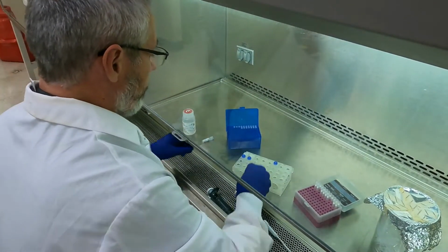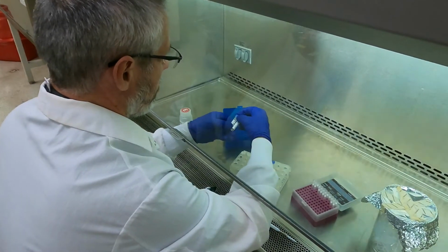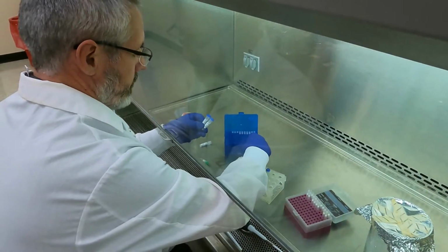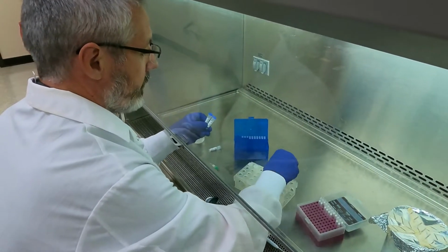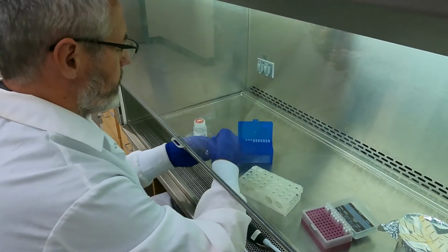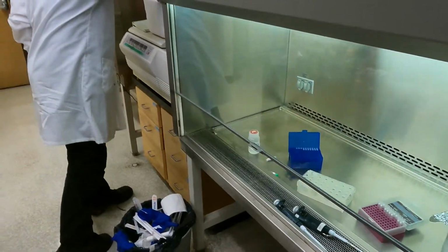And leave that for at least 20 minutes. So C16, C16, CU, good. And here is the buffer. It's IDTE buffer, pH 7.5. Just leave that, and then we'll take these back and freeze them.